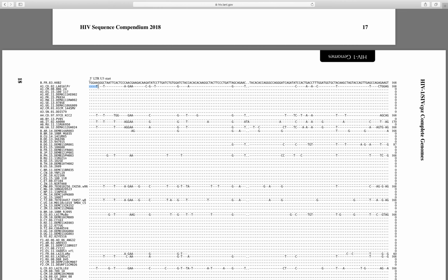So, and then so on and so forth, 3 bases that are the same, and then instead of a C, we have a T, and so on and so forth. You can start to skim through many different sequences, and so where there are gaps or where you can't see what is actually in the sequence because that wasn't captured by the sequencing experiment or by the depositor's experiment, you can start to see that those differences may actually be conserved in other viruses that are loosely related.